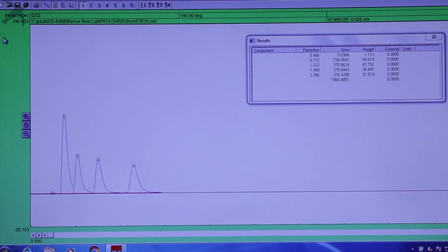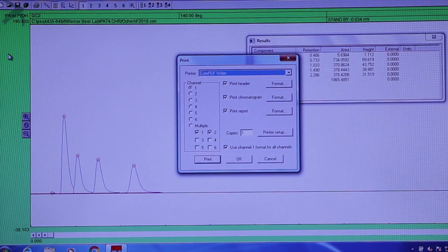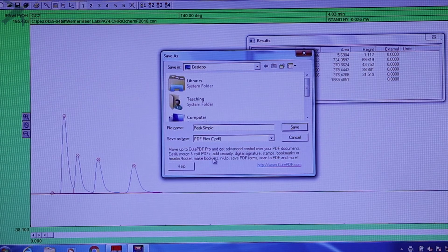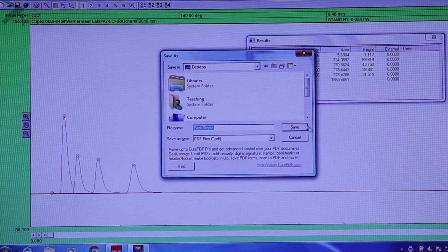You want to save your gas chromatogram, and normally it's saved as a PDF. To do that, you go to File, Print, and it comes up with this window. It says CutePDF Writer and the channel number one. You click on Print and it comes back with the dialog window. You will want to save on the desktop and you can give it a file name, whatever you want, and then you save it.